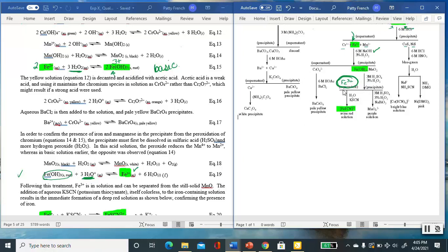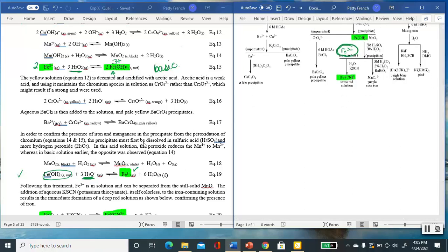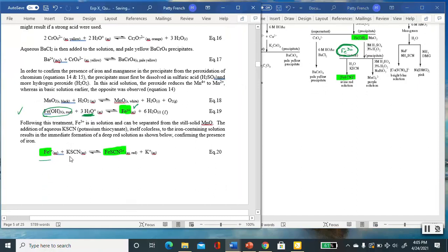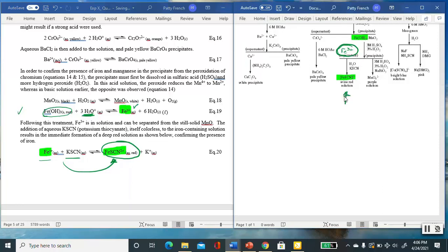So what we are going to do after that is our confirming test, or our identification test. Last fall in chemical reactions, exploring chemical reactions lab, we added some iron 3+ to potassium thiocyanate, and that allowed us to make this very identifiable complex ion. It's a deep, deep red, and that's what you're going to see, and that identifies iron.